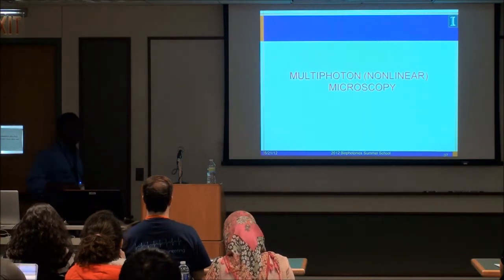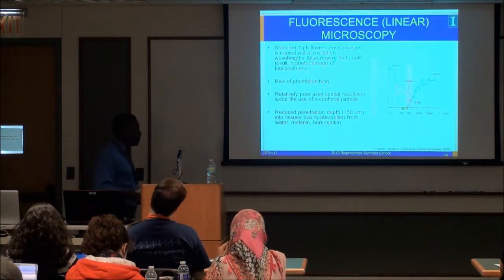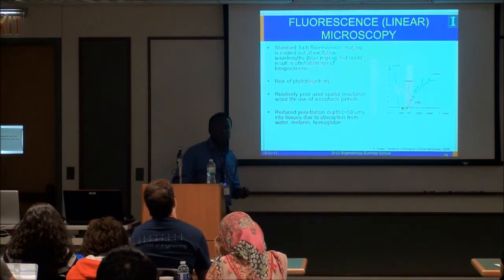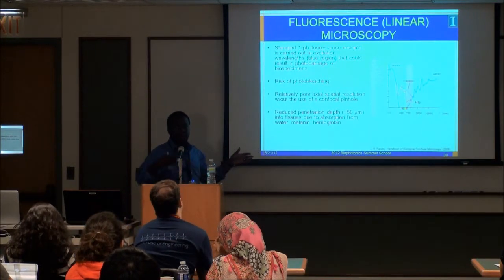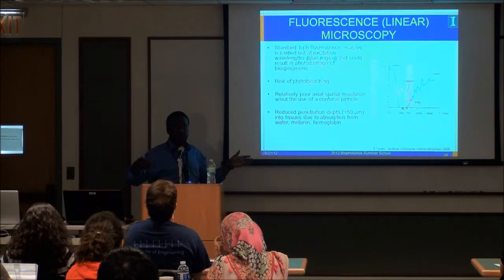All right, so this is the multiphoton microscopy work. Now this marries the two areas. I'll try to give you the essentials of what you need to know. And all of this, by the way, sets up a lot of what you would see in subsequent talks over the next couple of weeks.